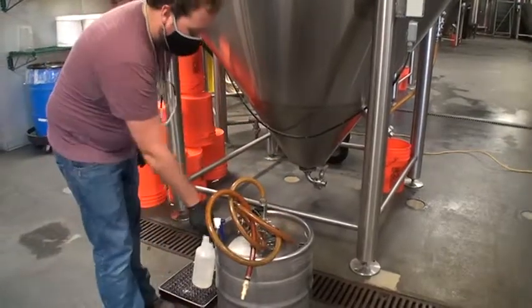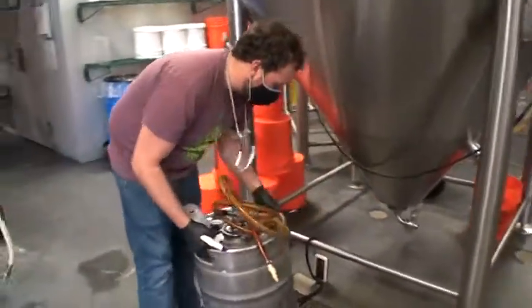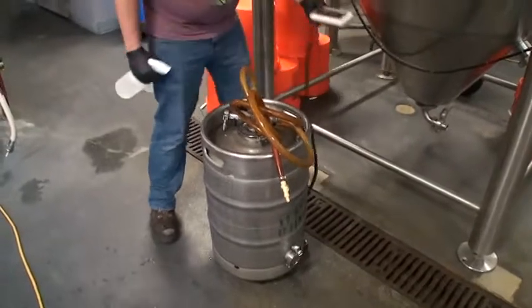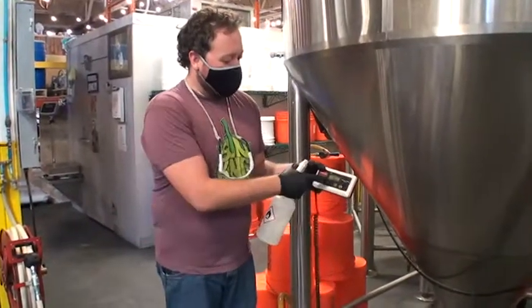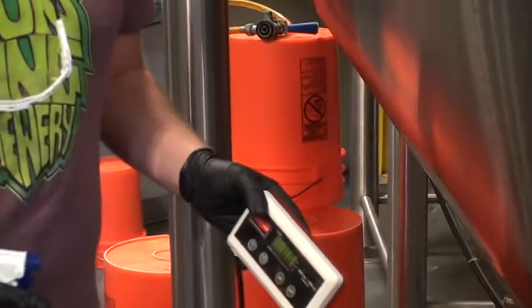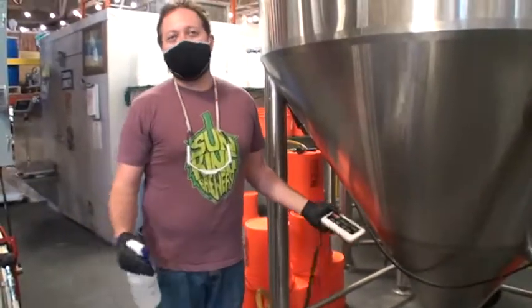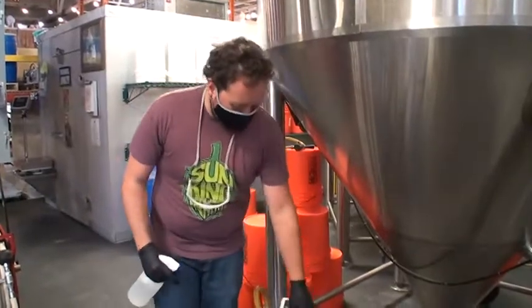Yeah, so we don't have to actually do that. We don't, yeah. So we always use the scale. This is just a Rubbermaid scale, nothing fancy. Again, we do it by weight because volume's too hard. And we'll just weigh this out until we hit our 61.7 pounds, whatever it was, for that day. Right. The brink should hold about 120 pounds of yeast. So this will be half full, that's perfect, and we're done. Got it. All right. Cool. Thank you.